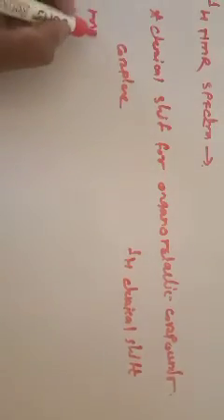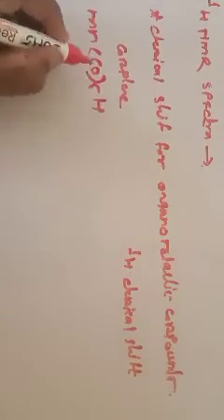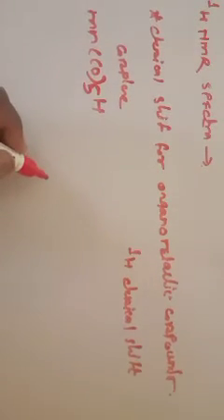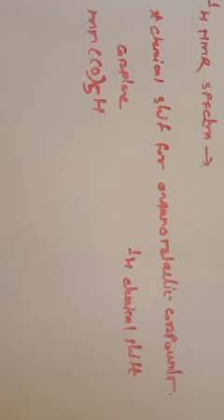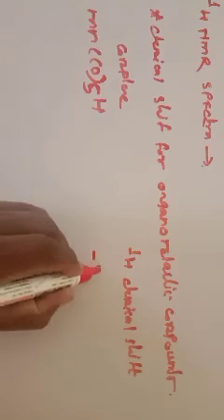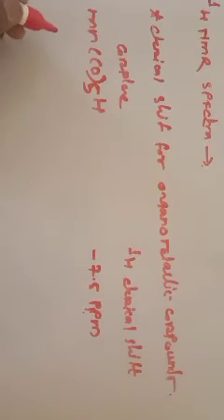If you consider the first one, that is MnCO by 5 and H. In this case, there are a total of 5 carbonyl ligands and one proton, which is directly attached to the metal atom. Its value is given, that is -7.5 ppm. So when the metal atom is Mn, this is the Mn complex.